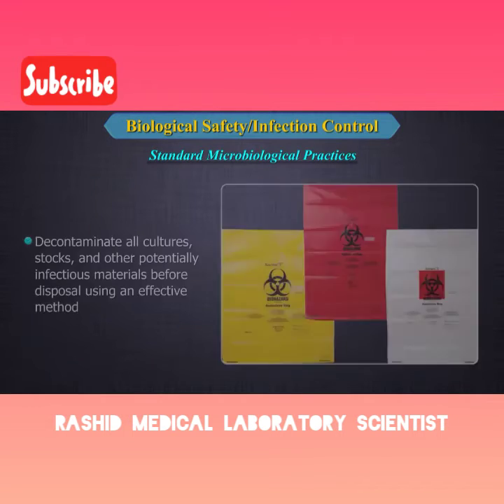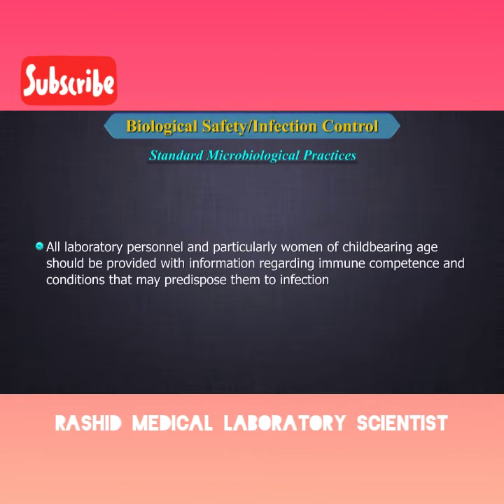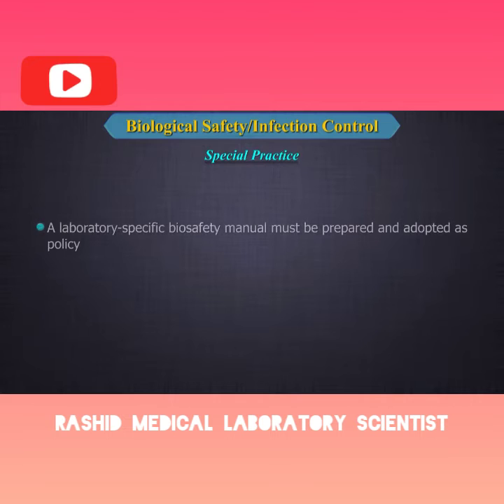8. Decontaminate all cultures, stocks, and other potentially infectious materials before disposal using an effective method. 9. All laboratory personnel, and particularly women of childbearing age, should be provided with information regarding immune competence and conditions that may predispose them to infection. There is also an importance of special practice. 1. A laboratory-specific biosafety manual must be prepared and adopted as policy.